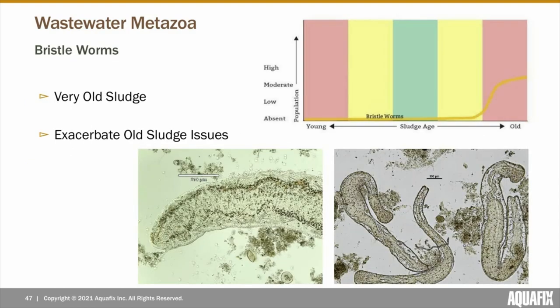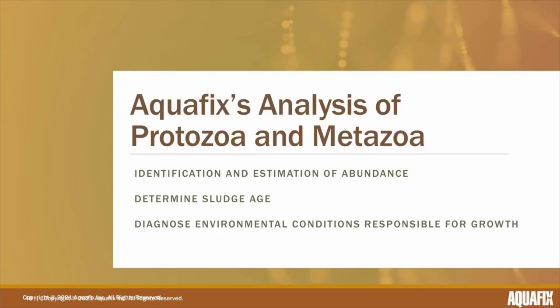Bristle worms are found in very old sludge ages and prefer high MLSS and low F to M conditions. They can be large enough to be seen with the naked eye, typically ranging from 300 micrometers to one centimeter. Bristle worms have been known to reduce MLSS levels by consuming bacteria. Unfortunately, they have a tendency to consume the younger and healthier bacteria, which exacerbates high sludge age related issues that may already be occurring. In our analysis, we identify and quantify the metazoa and protozoa present to help determine sludge age and diagnose any environmental conditions responsible for their growth.